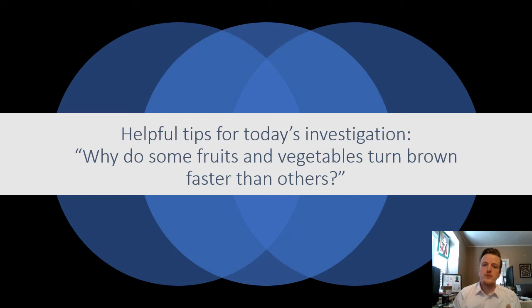So in lecture, we've been talking about enzymes and their activities and how they work under different conditions. And last week we talked about and learned how they are proteins, and they're strings of amino acids, and they're really important for actually carrying out a lot of biological functions. And so this week we're going to be looking at how an enzyme, in this week's case catecholase, operates under different environmental conditions and which ones are the best for that enzyme.